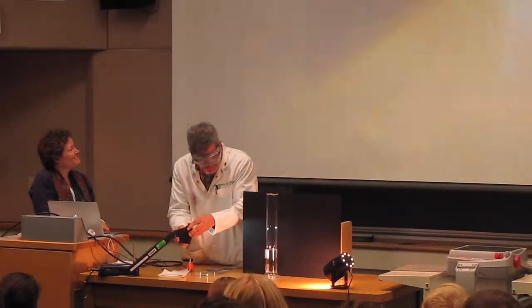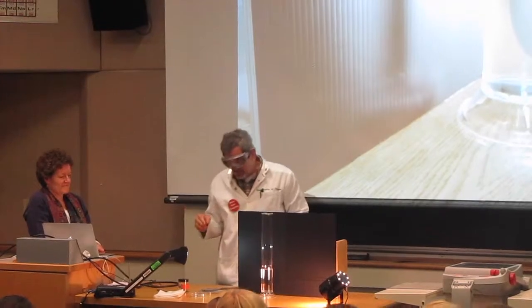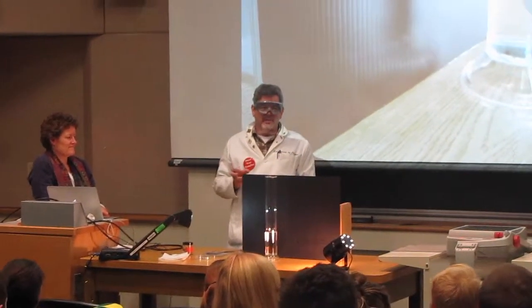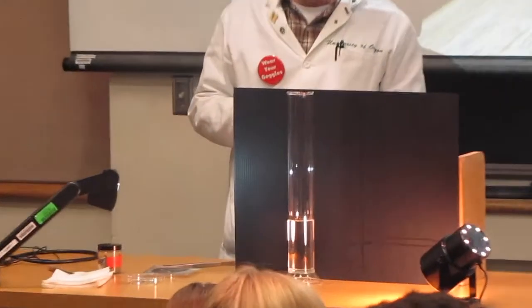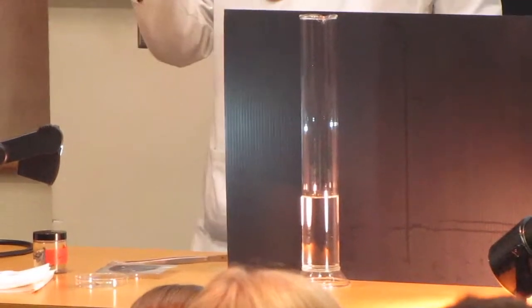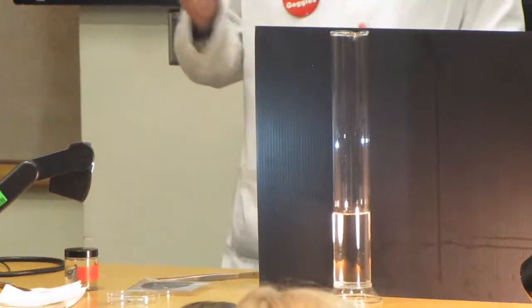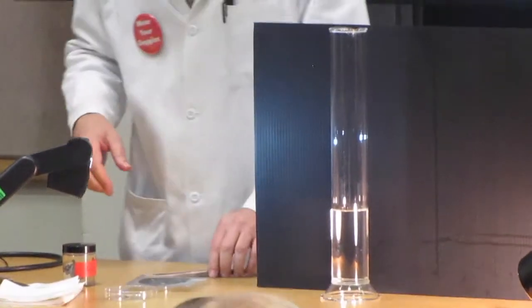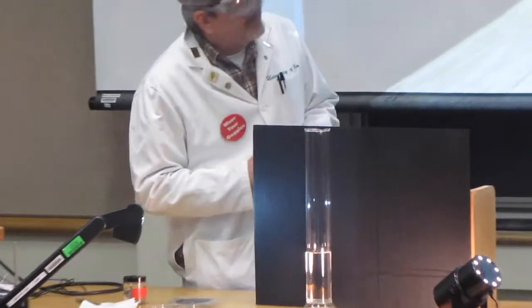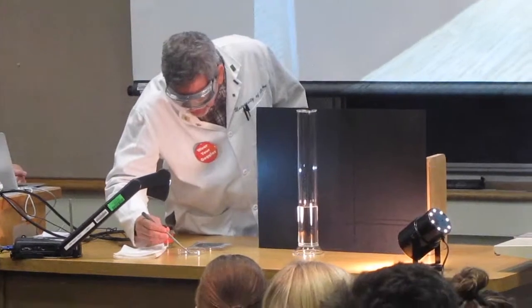Okay, so I've got some water over here. I'm going to drop it in water and we're going to see what happens. Now, in terms of how soft it was, kind of about as hard as Parmesan cheese, not the cheap stuff that you buy that's already grated, but the expensive stuff that you can't afford yet because you're a college student, that's not grated yet. Okay, so it's about that hardness.